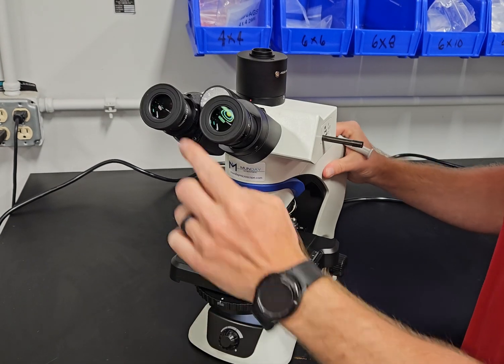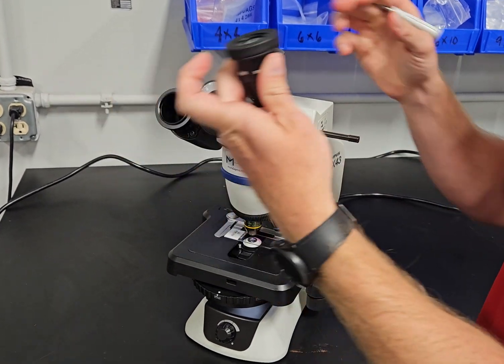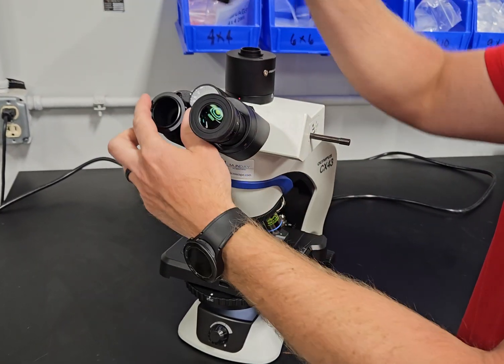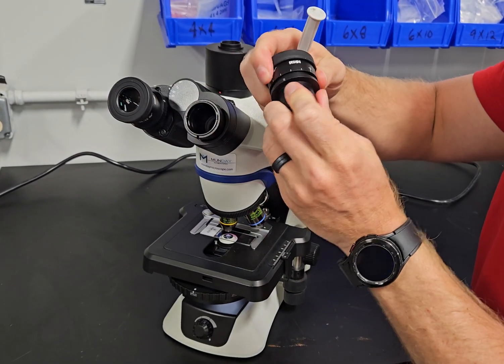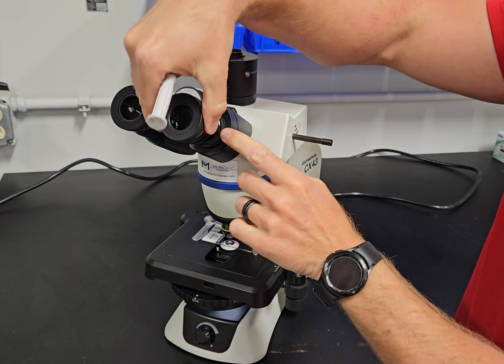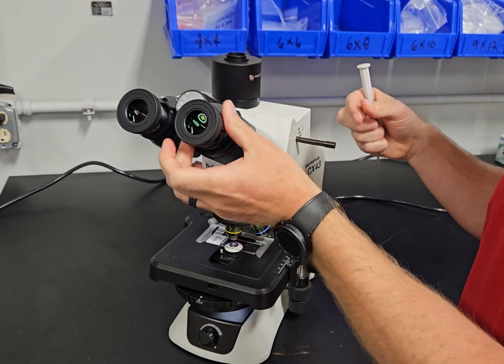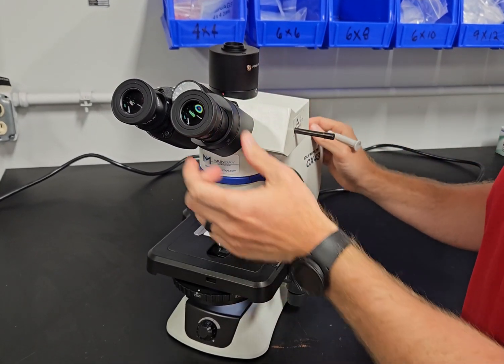It has two 10x by 22 millimeter field of view eyepieces. This side has a diopter and a fixed eyepiece. This side we have a focusable eyepiece. Sometimes this can be fixed, but this customer wanted a focusable eyepiece on this side.